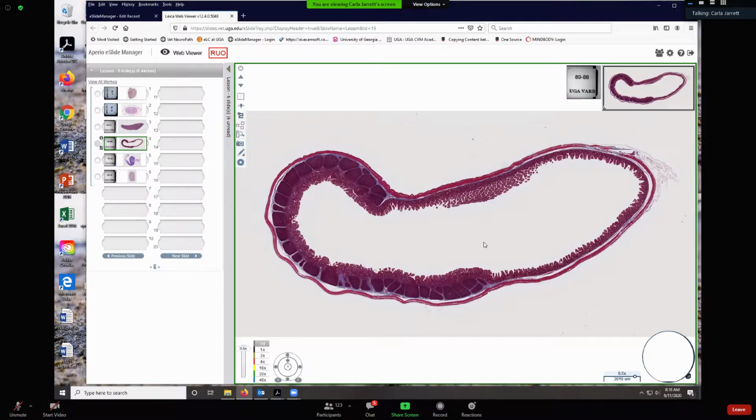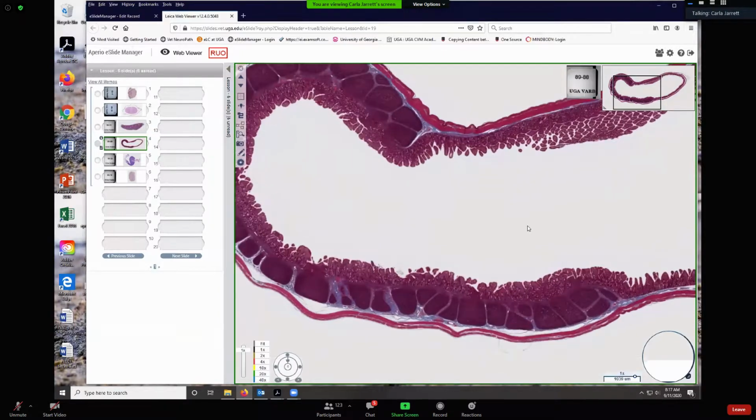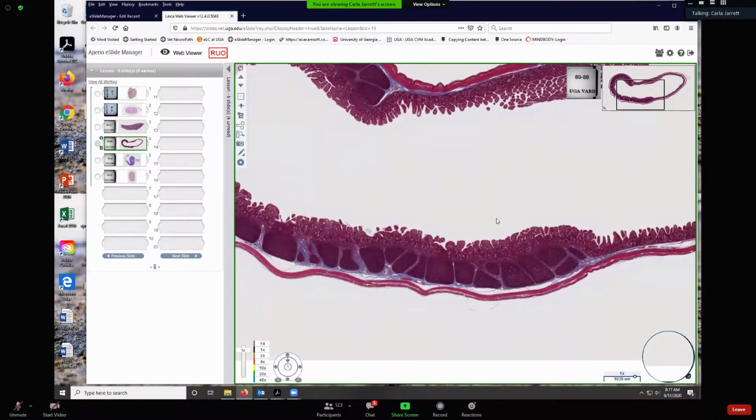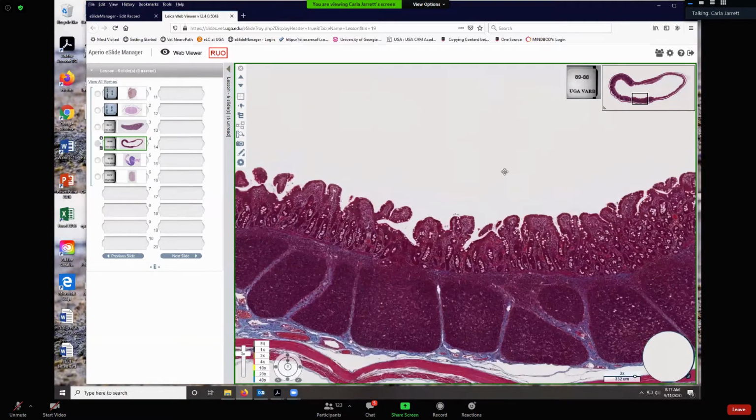But as adults, these Peyer patches can form anywhere. It tends to be the small intestine. And we still call them Peyer's patches, even though they're not true Peyer's patches. We're all just lazy and we just call them Peyer's patches, but they're actually secondary lymphoid organs at this point.